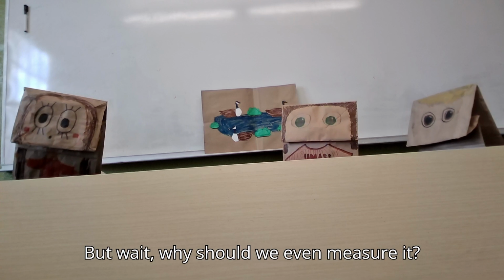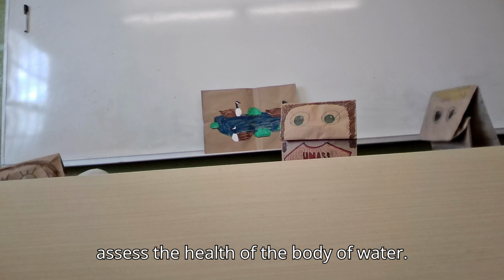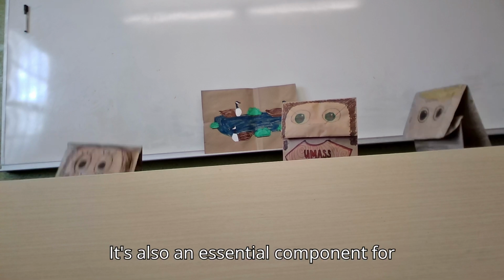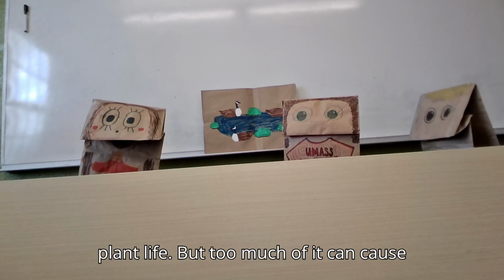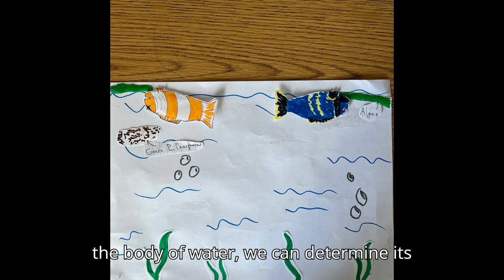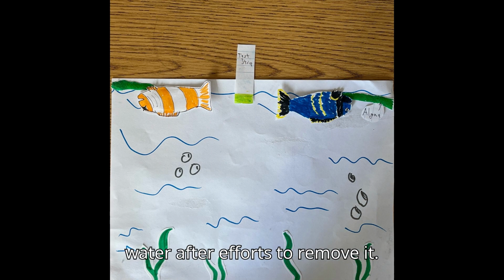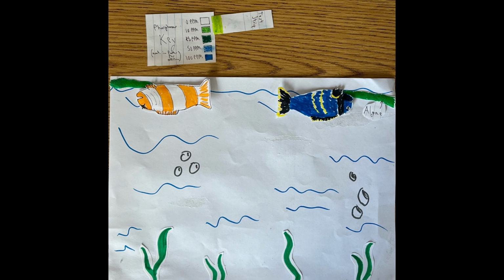Interesting. But wait, why should we even measure it? Measuring phosphorus is important to assess the health of the body of water. It's also an essential component for plant life, but too much of it can cause problems. By measuring how much phosphorus is still in the body of water, we can determine its health and perhaps more importantly, how much phosphorus is still left in the water after efforts to remove it.